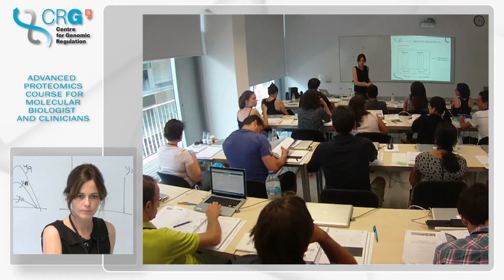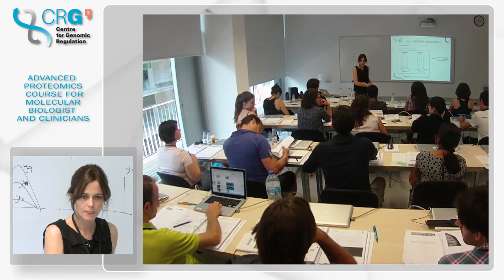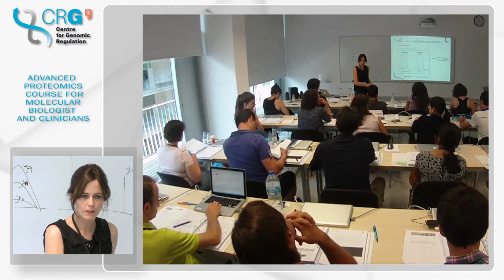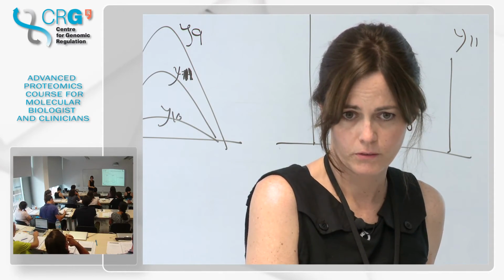But you never play with your sample, like you don't test which dilution of your sample is the best for your test. Yes, you should. You should also.